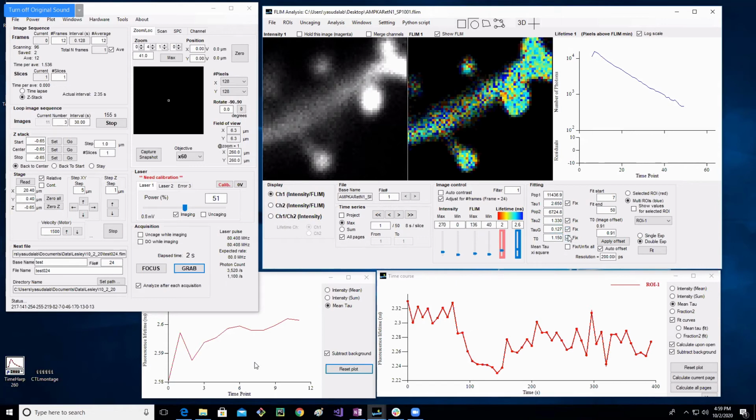I don't have, honestly, a super clear understanding of these exact values. Maybe Long, is Long still here? Yeah, Long is still here. If he wants to chime in, if he's still listening, he can. But to me, the value should be fixed across all experiments. It's a measure of your system response, but they're not. They're dependent on your system. And each experiment you do, we fit them again. So I don't totally understand that.